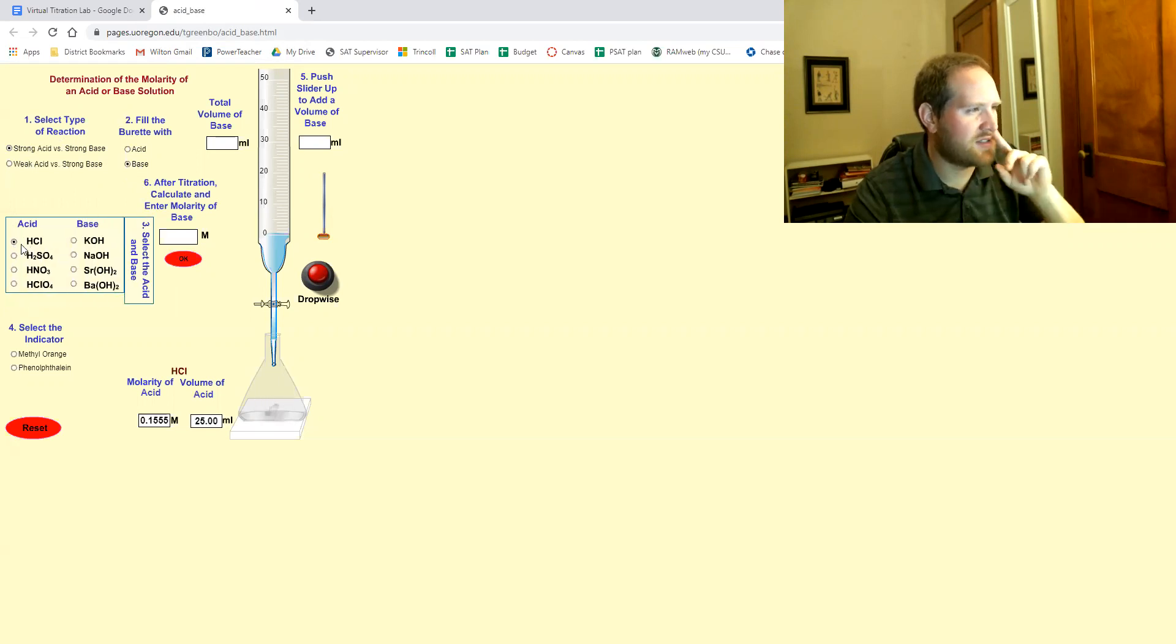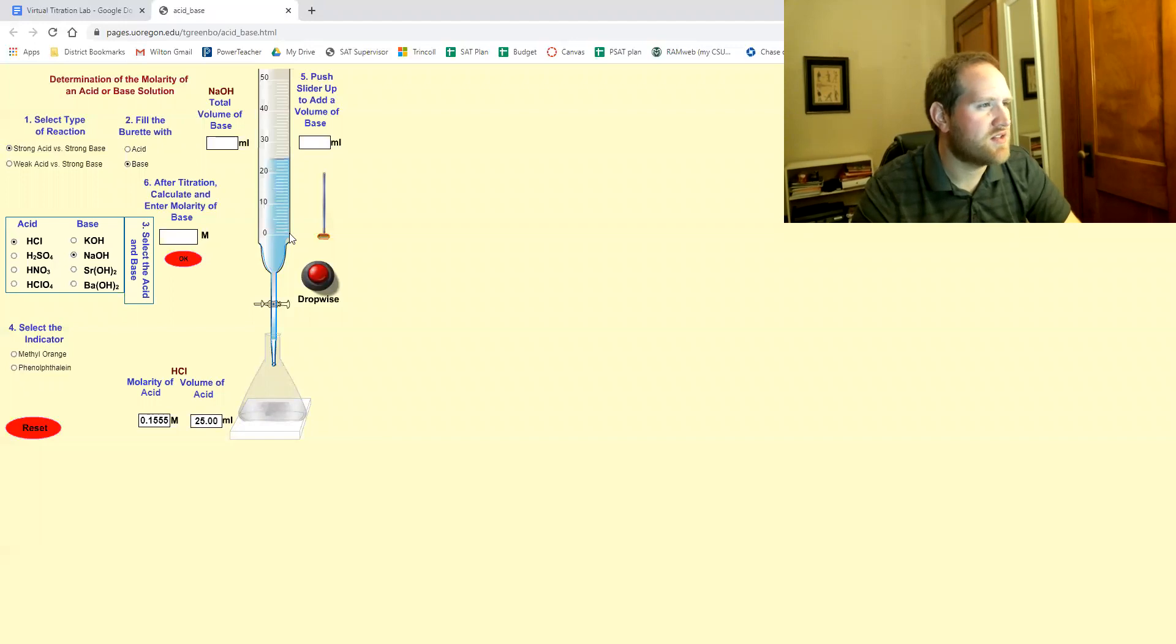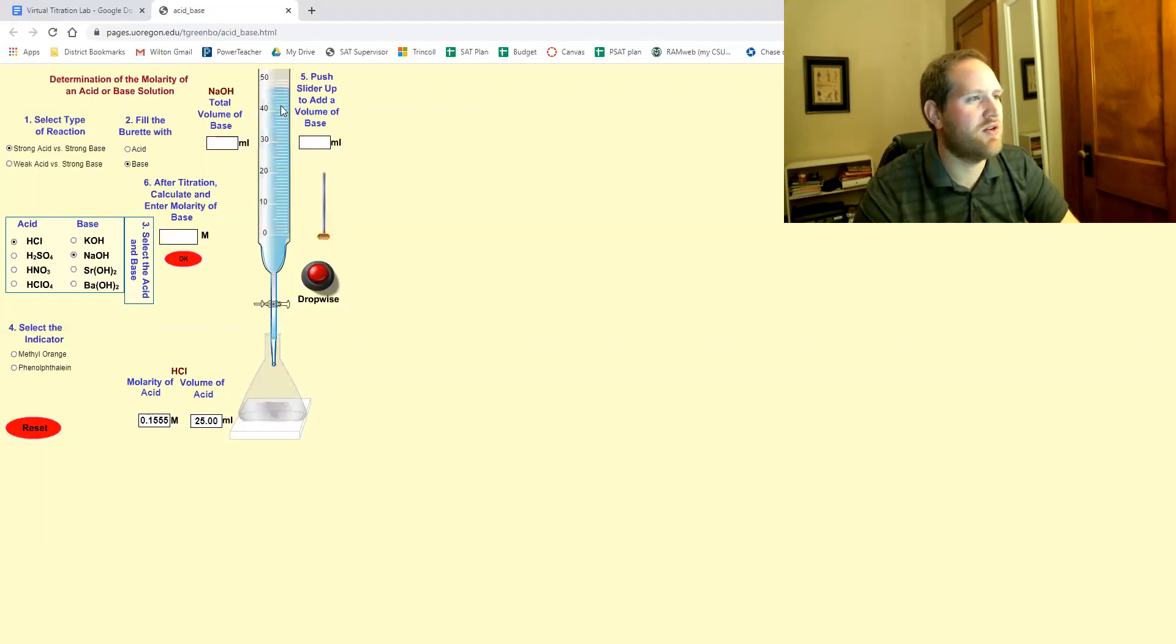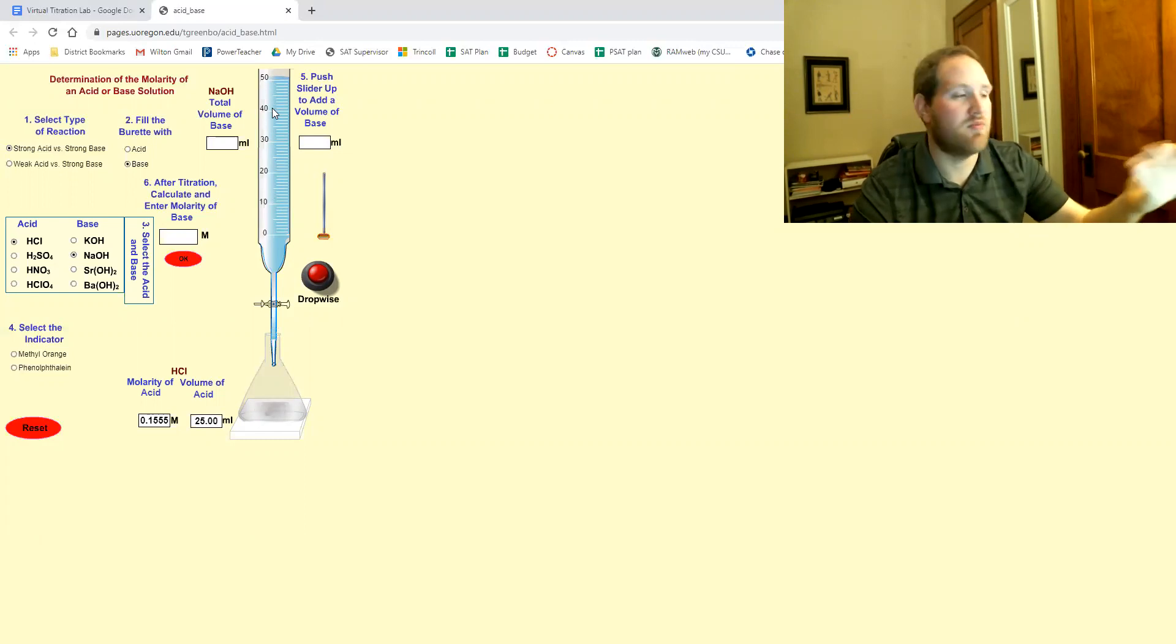Our acid is gonna be HCl, our base is gonna be NaOH. See how it fills the burette now? So there's our NaOH in the base, NaOH in the burette.